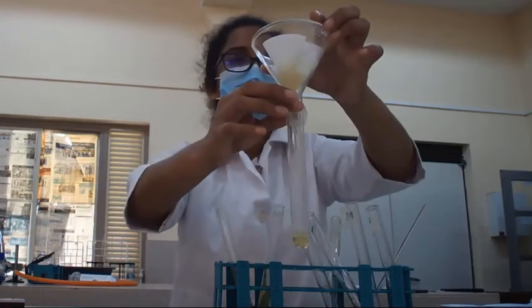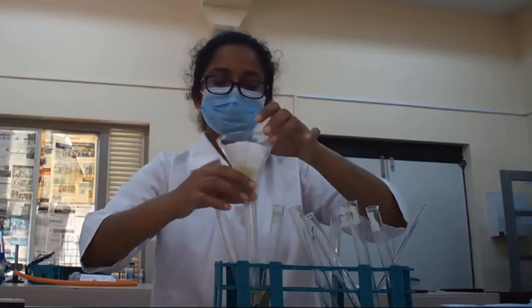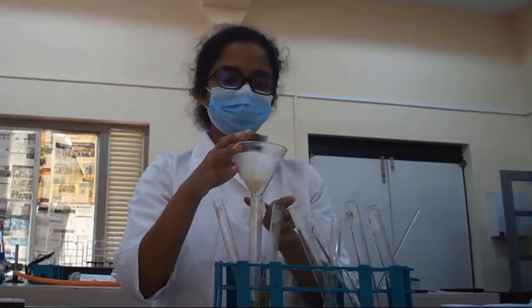I think you can see it, okay? Then likewise, we are going to filter each of the sugar solutions we use today.